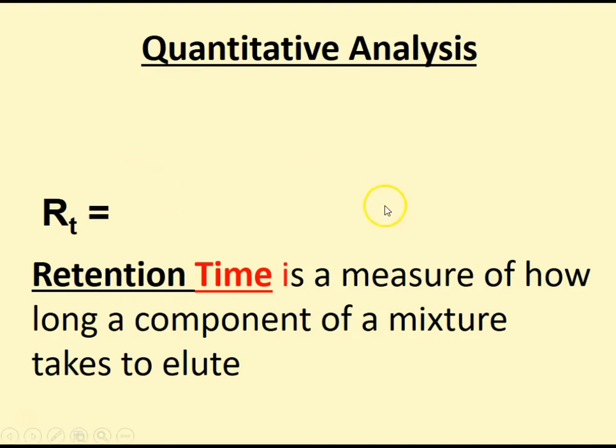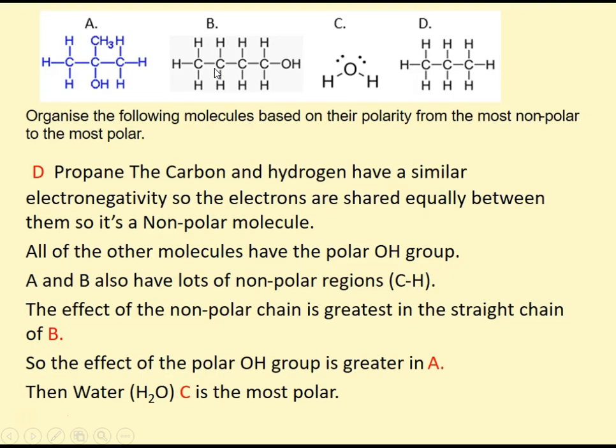Okay, so the retention time, can you change that? That is to be talking about what it is, not how much. All right. So how long it takes to go through depends on the shape and the attraction that the molecule that you're separating has for the stationary phase and the mobile phase.